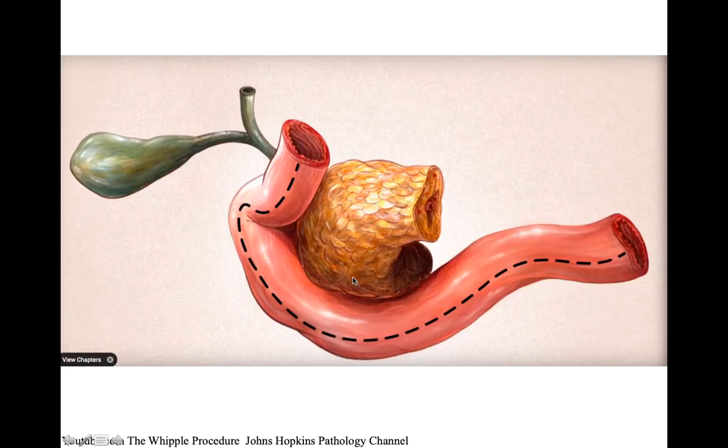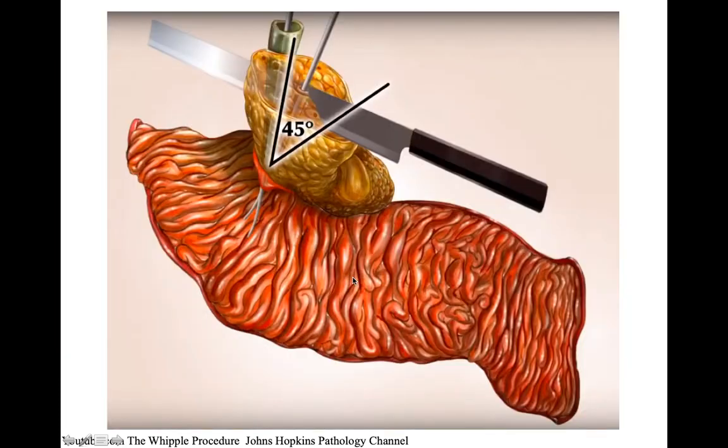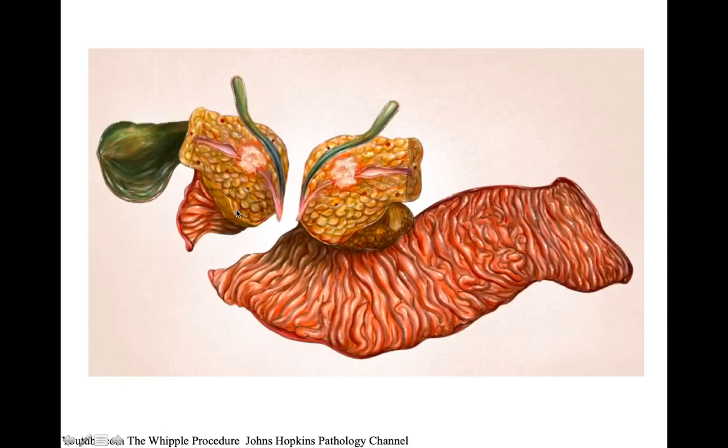Then we open up the duodenum, and then we bivalve the pancreas when we have two probes, one in the bile duct and one in the pancreatic duct. We get this really nice specimen, and then we let it fix overnight, and we take our sections the following day or later in the day, whichever is better for you.